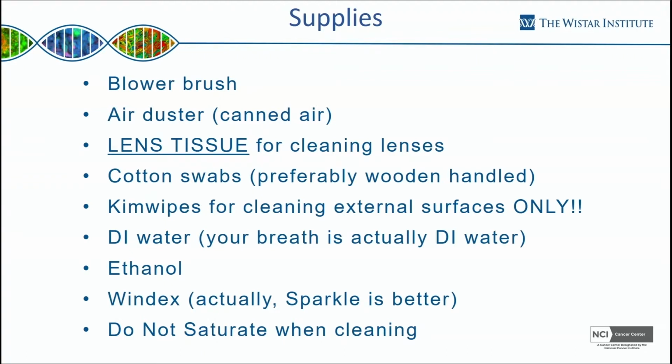Just go, and there you go, you got some. Ethanol is the other kind of go-to thing if you want to clean most things that you might find on a slide. Windex actually works pretty good too, although Sparkle is better than Windex if you have access to that.